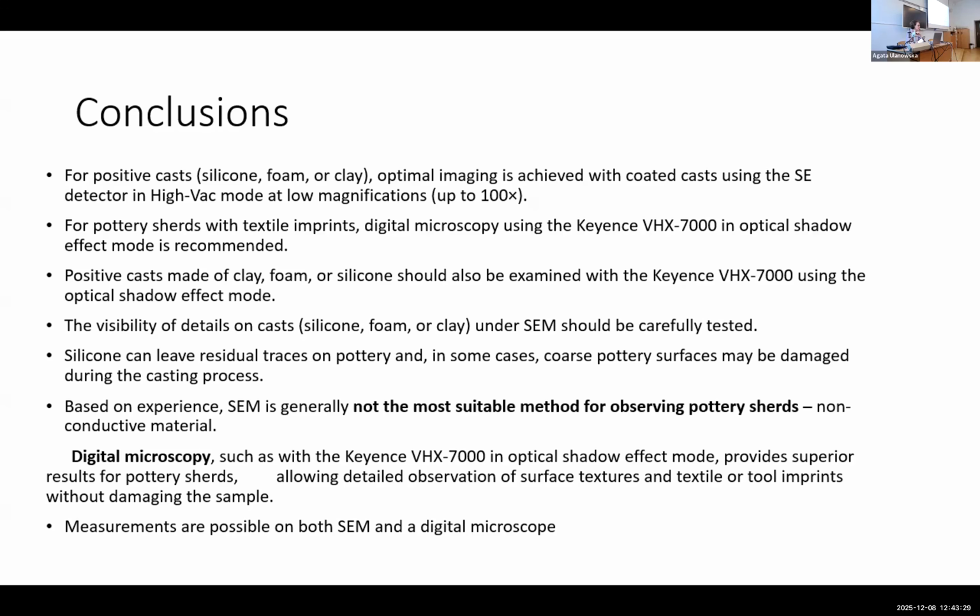The visibility of the details on casts, silicone, foam, or clay under SEM should be carefully tested, also with the experiments. Because I think that maybe we'll see some differences. I mean, if we use a thread made of wool or bast fibers, we should see the differences in the imprint on SEM and on the TS.